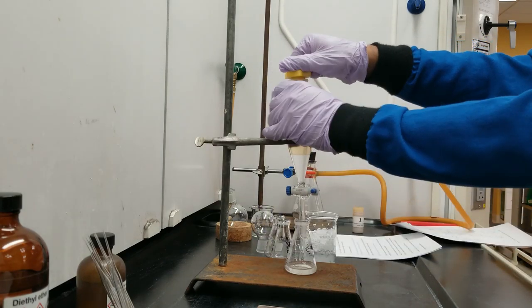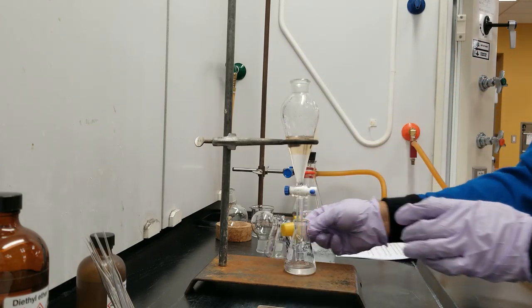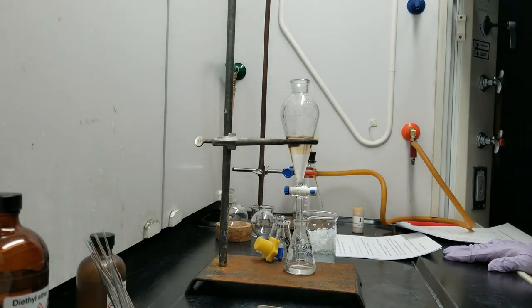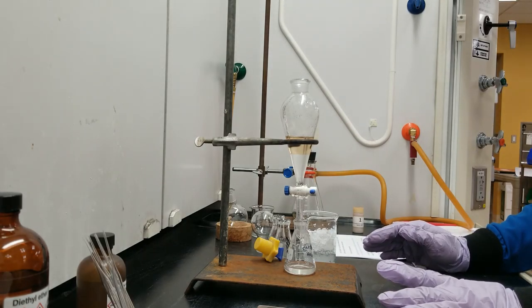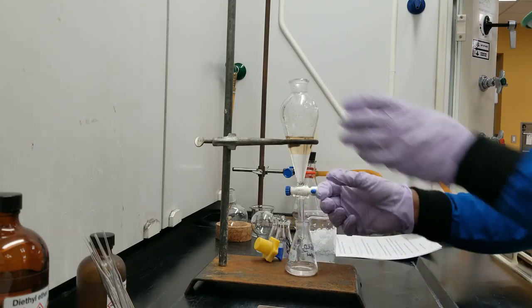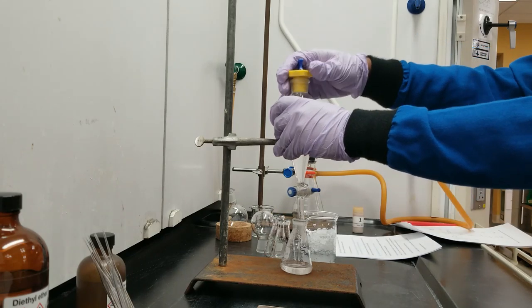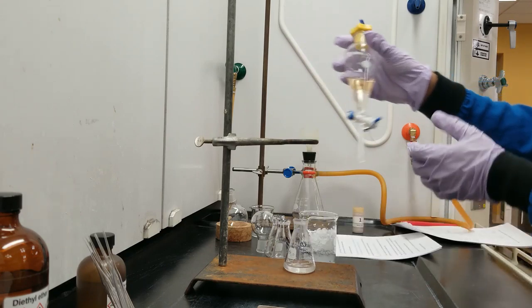Resting, the lid should come off to avoid pressure buildup, as I have mentioned earlier. We wait till the layers are well separated. It looks like they are well separated. So I perform shaking once more.